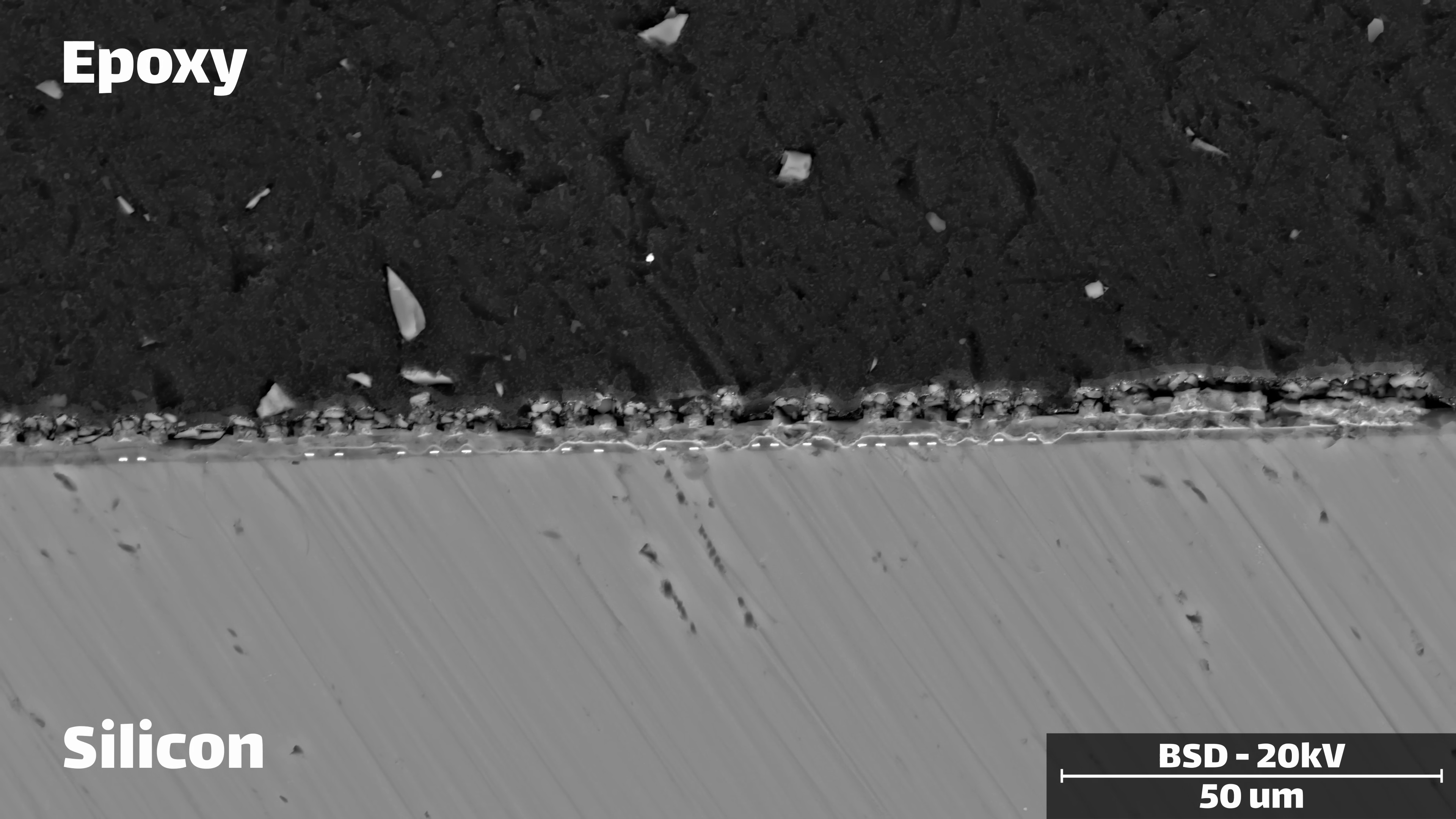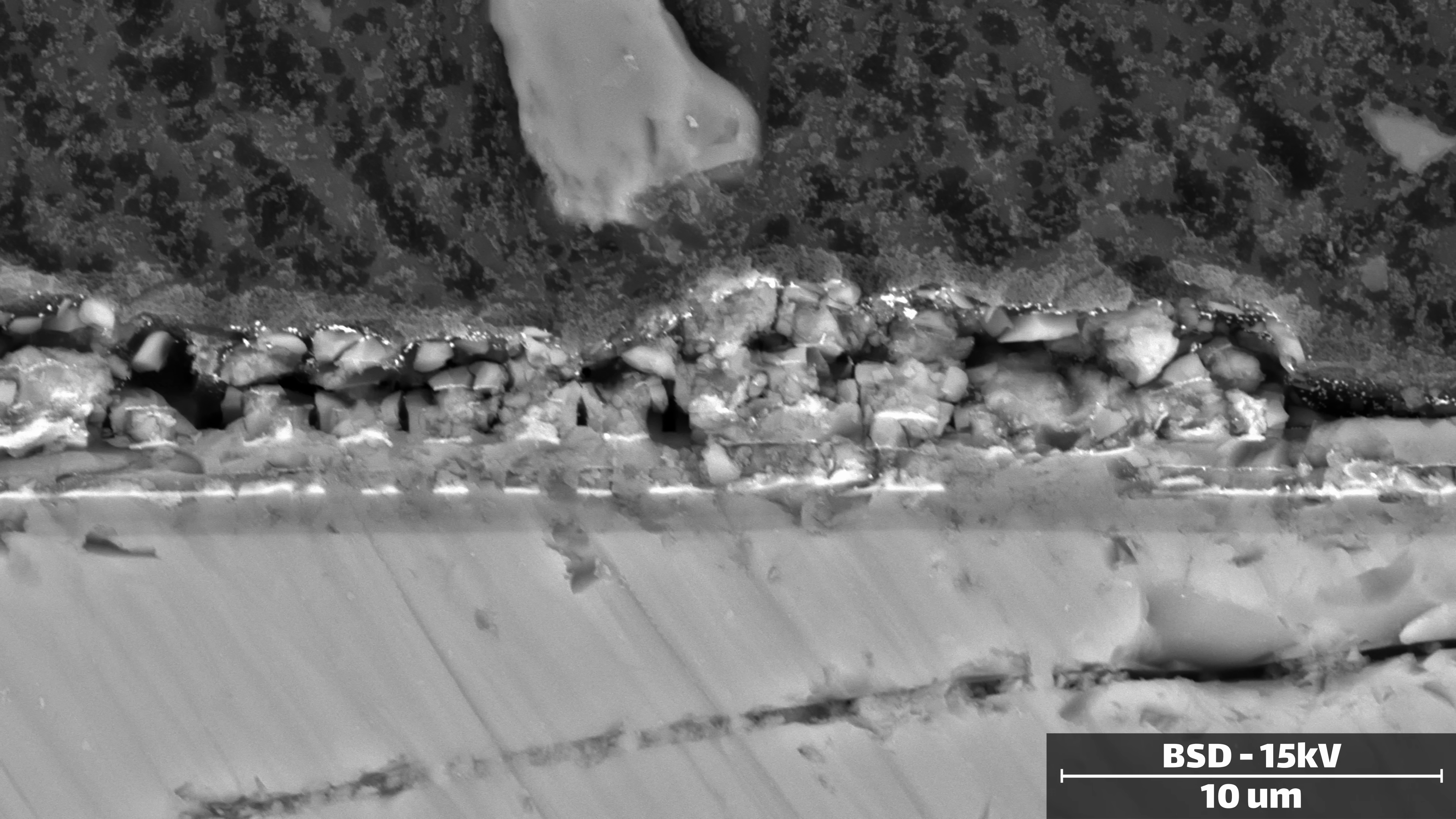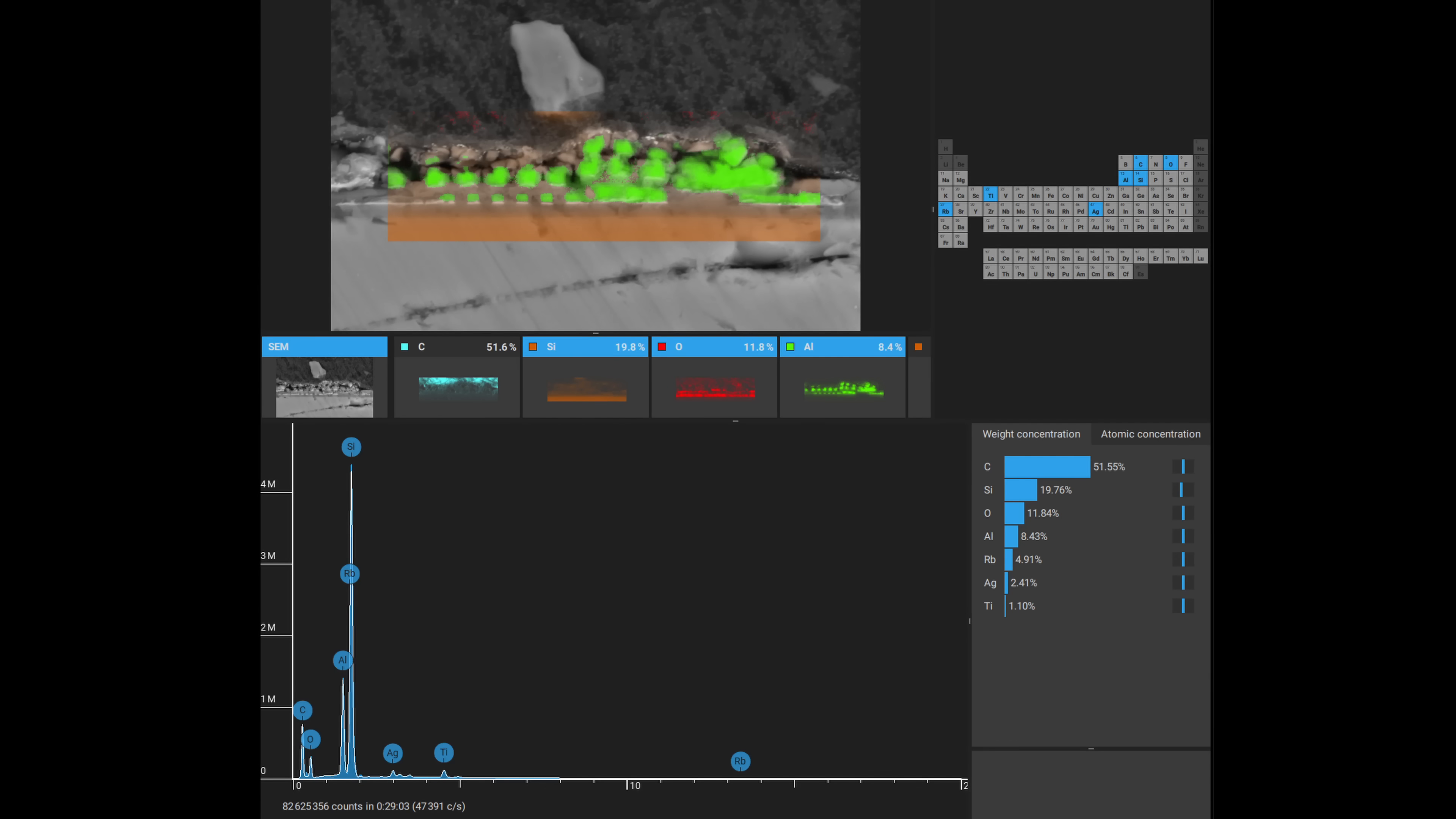Likewise, a cross-section shows some interesting details. To help understand what's going on here, we can enable a detector that identifies different atomic elements in our sample.